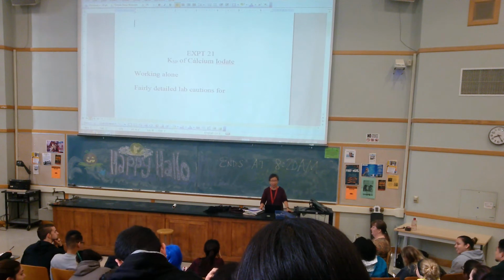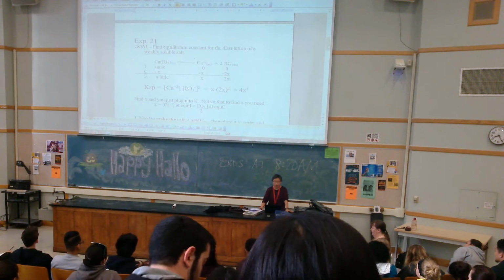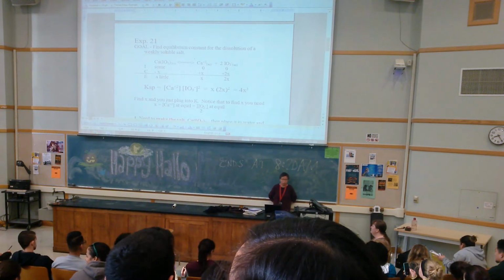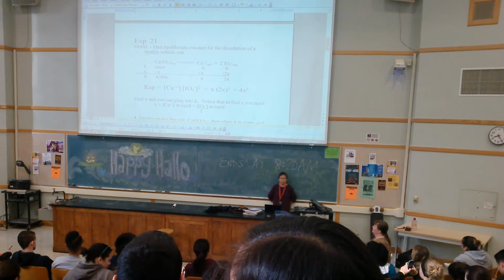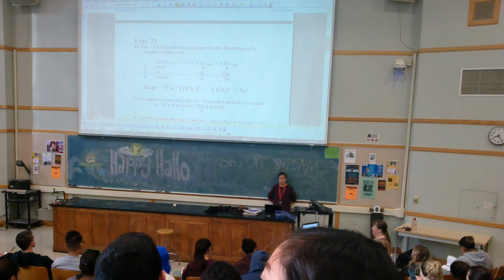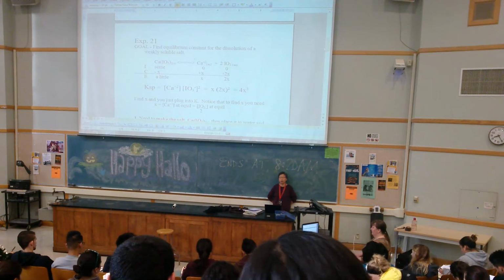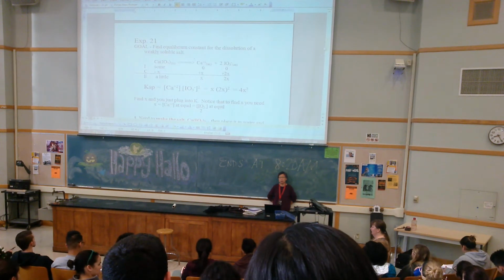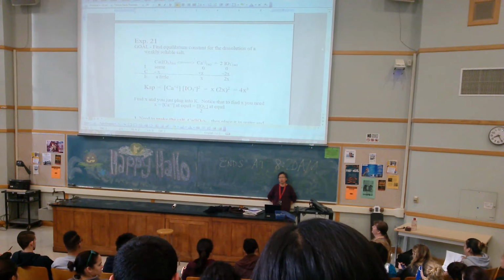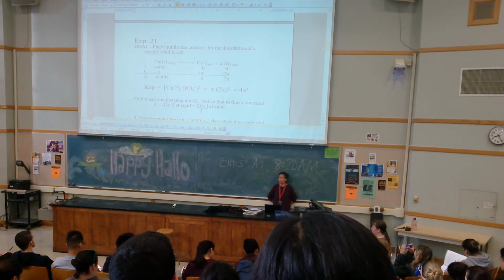All right. So you're doing a KSP, right? Your goal is to find the equilibrium constant for the dissolution of a weakly soluble salt. Copy this equation down. Calcium iodate. If you forgot what iodate is, it's IO3, the charge is -1. So taking photos is very non-conducive to learning on your brain. Copying is a good way to do learning.